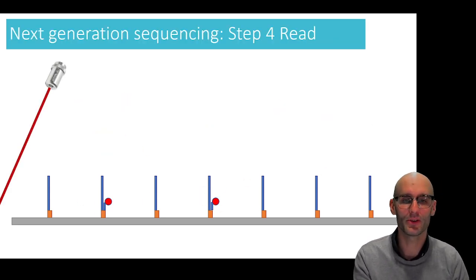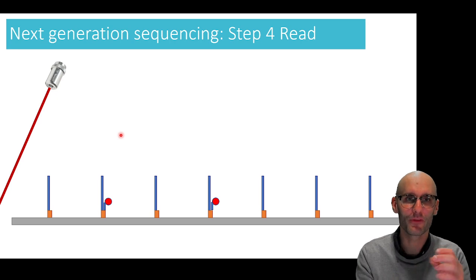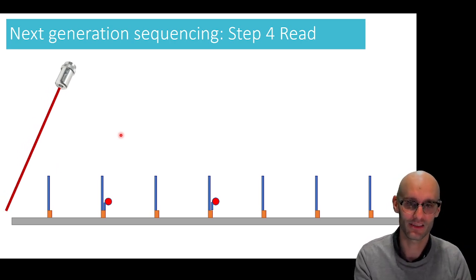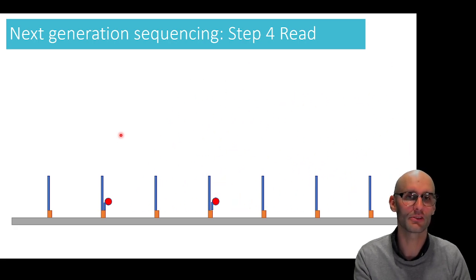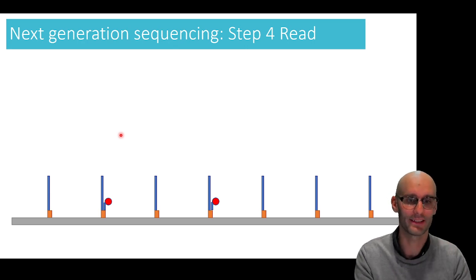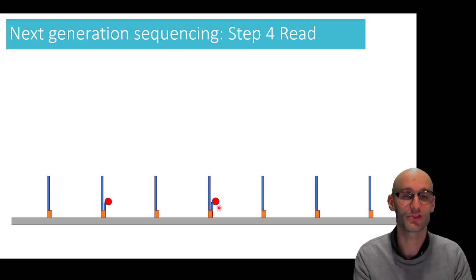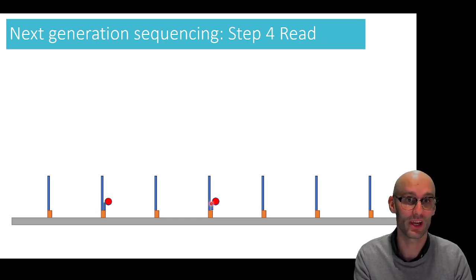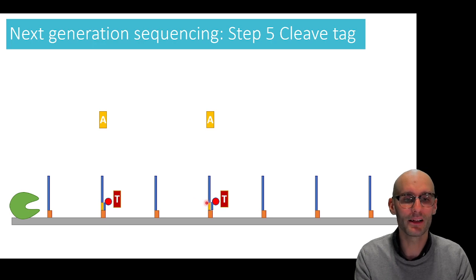So now what we do is we run a laser across it, and we look for the fluorescent sparks at that specific location in the glass slide. So as we run a laser across, we get that fluorescent tag fluorescing, and that is recorded. Where exactly did we get that little burst of fluorescence? And so it was above this strand and this strand. We've now recorded that there was a thymine attached to this strand and this strand of DNA. So now we can conclude that this strand has an A right there and an A right there.